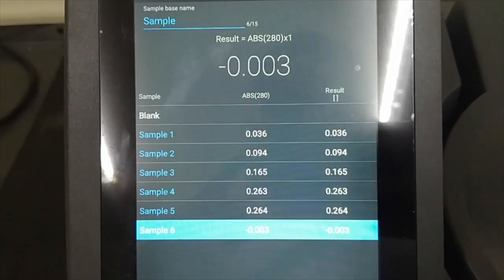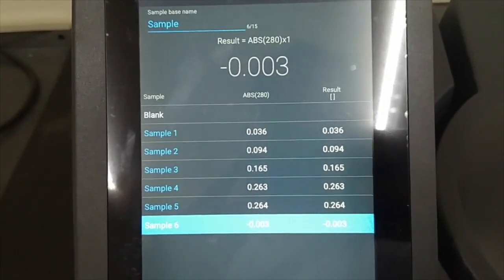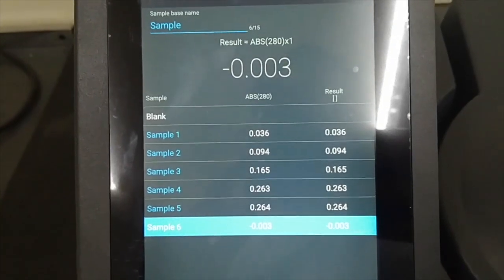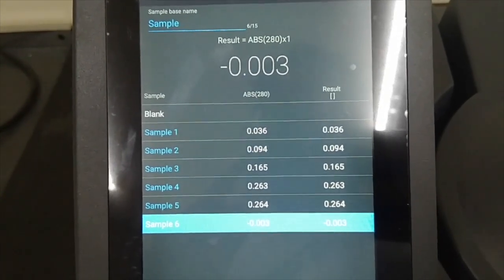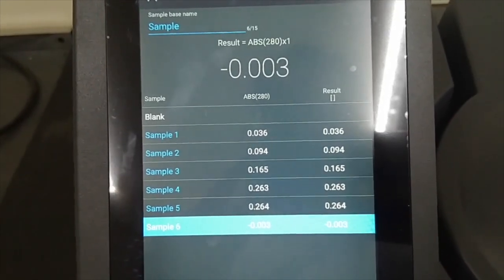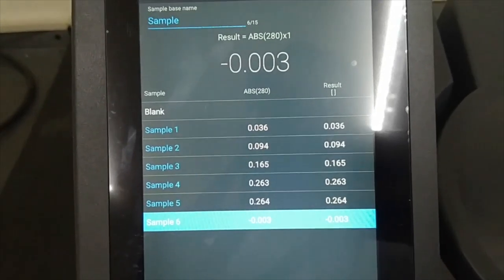Now you need to proceed like your experiment number 1 and 2. You need to calculate the protein concentration for the respective ODs, and draw the graph between concentration of protein on the y-axis and the time of mixing on the x-axis, and find out the optimum time.